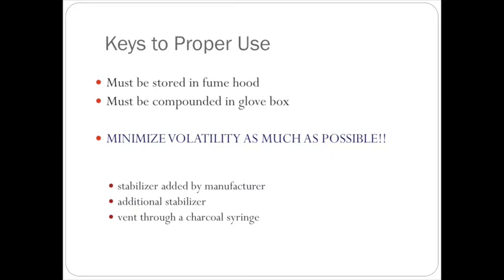And if we do any of that kind of manipulation, we actually will do that in something called a glove box. There's a couple reasons for that. Number one, because we can kind of isolate it. That's probably going to be the most likely place where you'll spill something. So it's easier to clean up than in the area where you're storing all of your stuff.